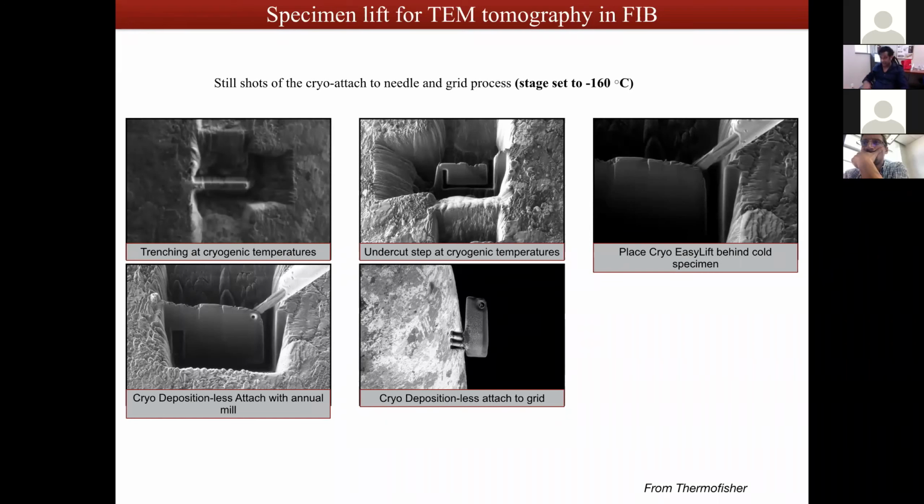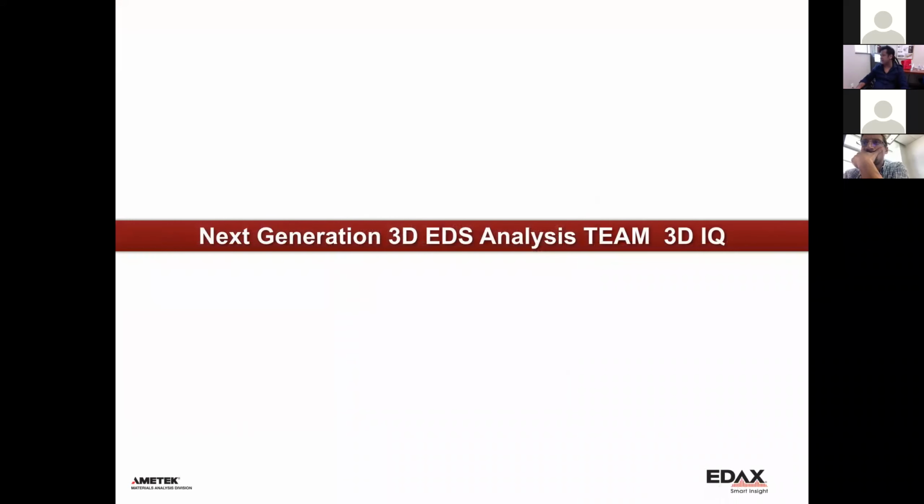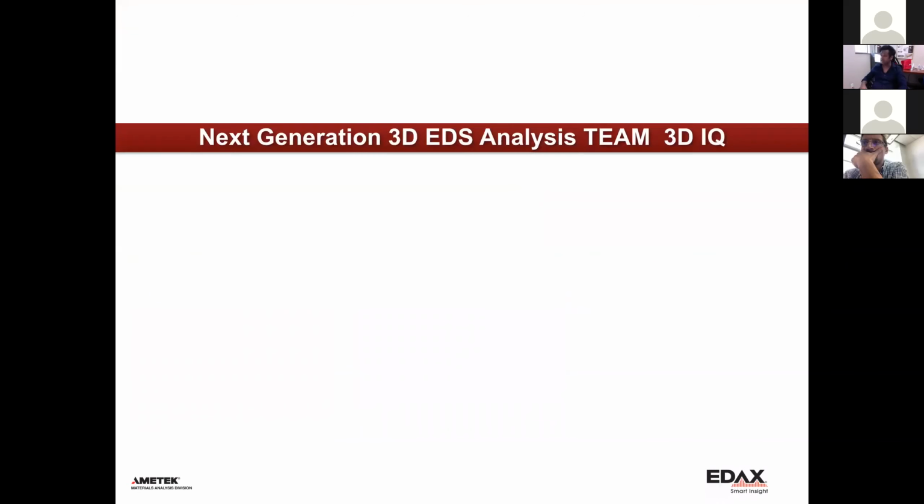All right, now from EDAX, we will have a 3D EDS software package called TEAM 3D IQ. Usually, we do 2D EDAX EDS analysis of the specimen.